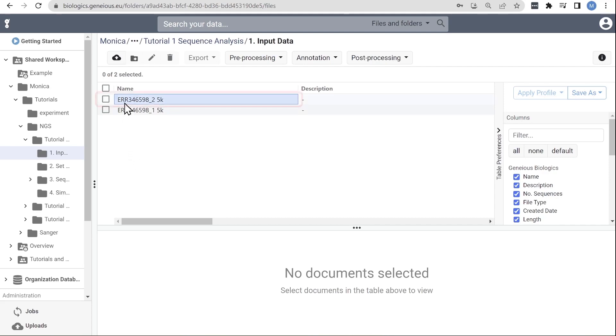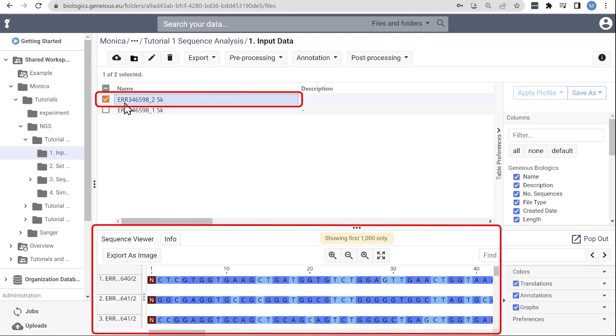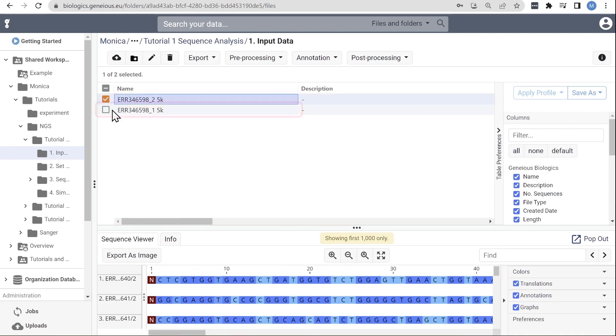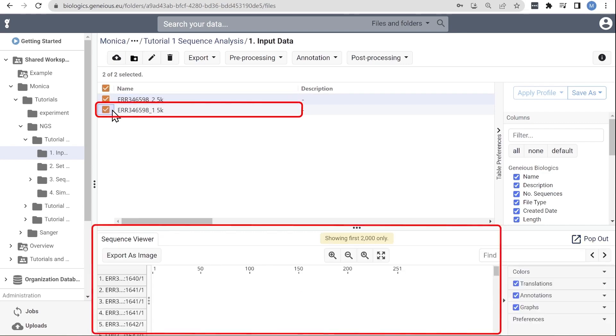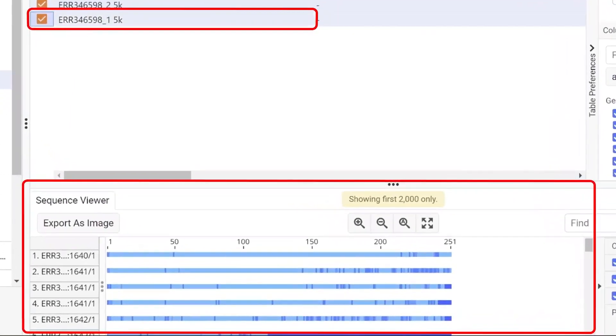For example, let's look at raw Illumina MiSeq data. For this example, we'll be working with two files of 5000 forward reads and 5000 reverse reads, typical of sequencing results from Illumina MiSeq. You can see the sequences here.